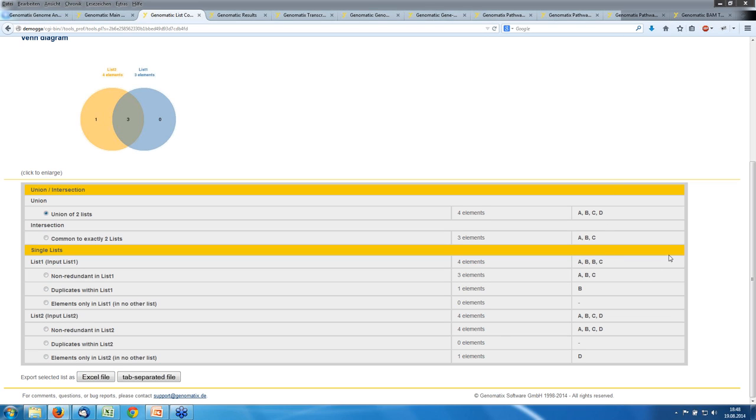Okay, so much for the overview of the July update of the GGA and the Genomatix software suite.